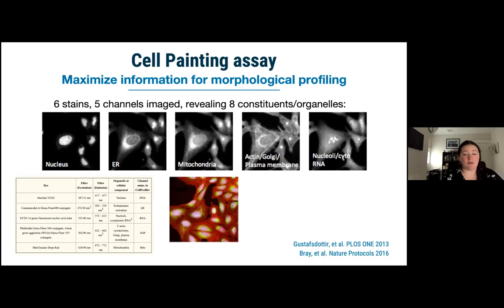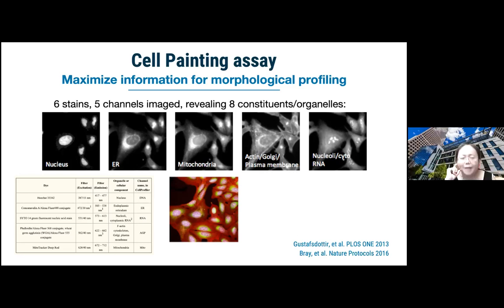Yeah, we've definitely worked with some teams. We've never done it in the context of cell painting, but certainly we've created CellProfiler workflows to look at calcium signaling. I know we've done some publicly on the forum. There's some also in publications. If you go to our list of publications, there's definitely some there. Okay, all right, thank you.